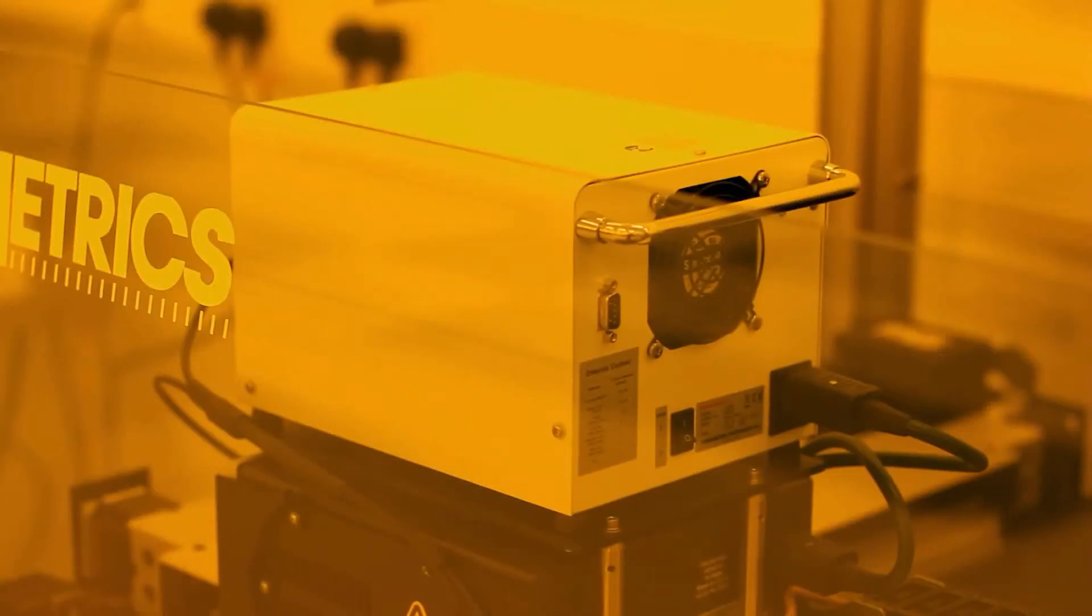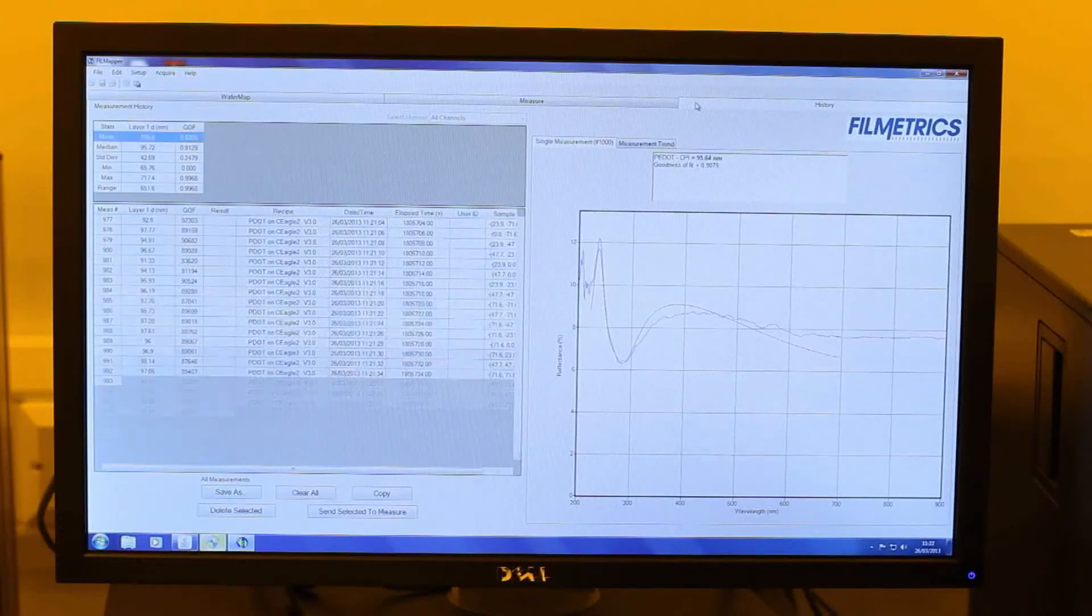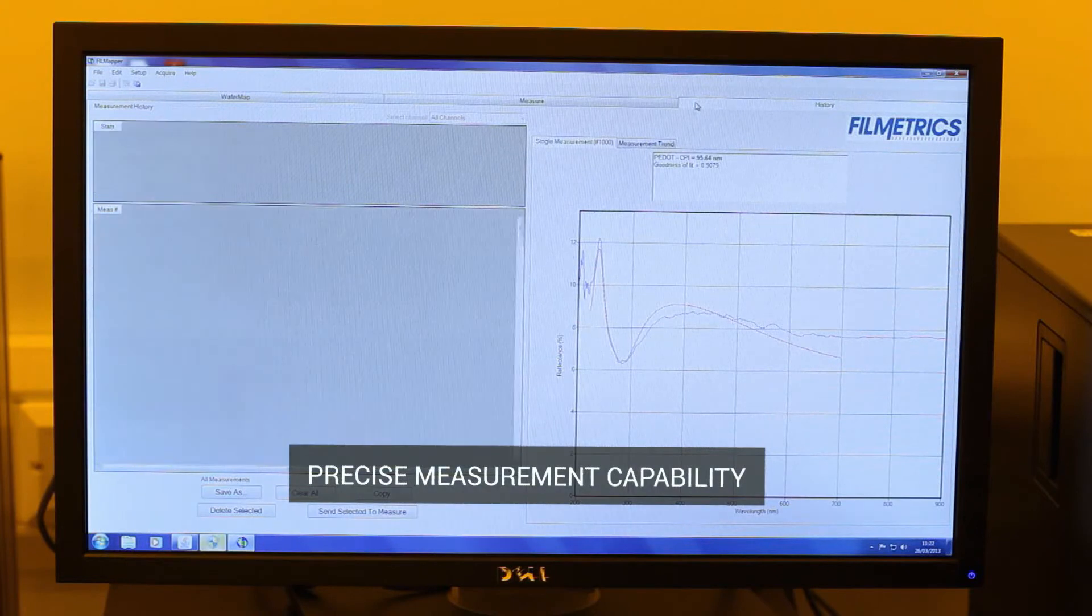Automated thin film metrology is utilized to measure precise film thickness and uniformity, enabling the user to quickly characterize and optimize the coating process.